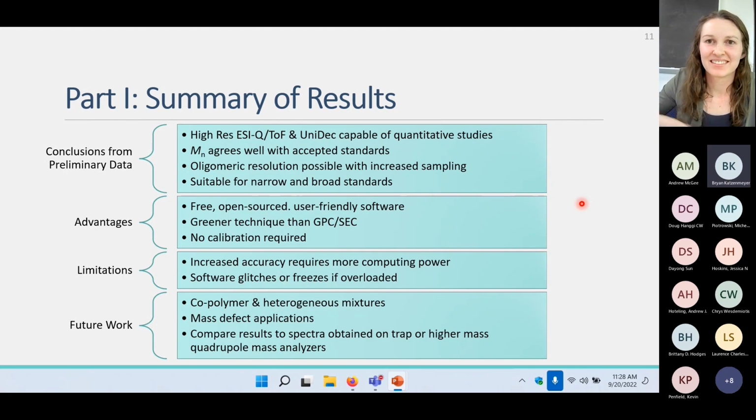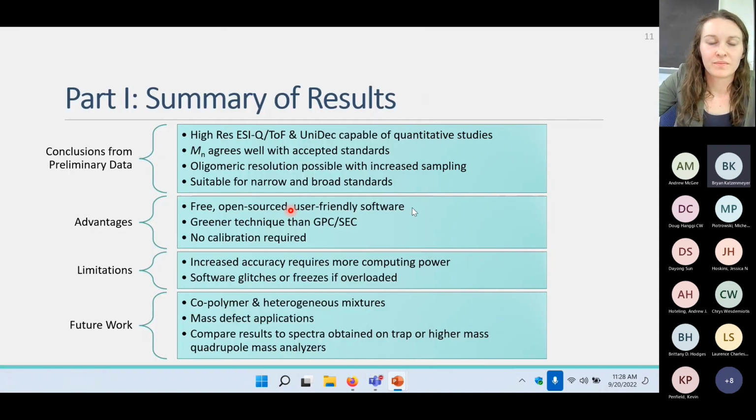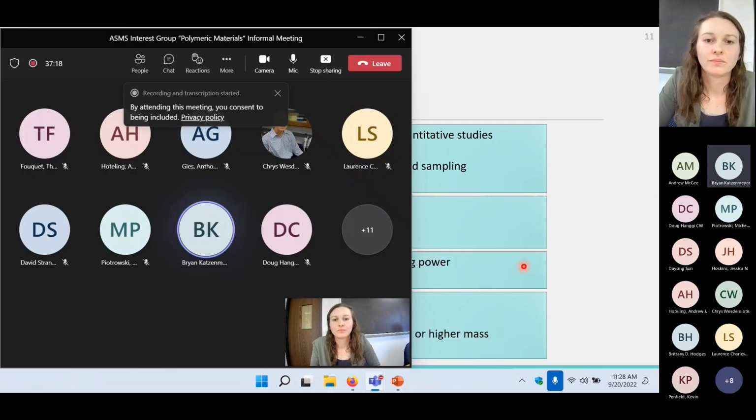No problem. We have the MRT, which is multi-reflectron time of flight, that allows us to go up to 200,000 resolving power, in excess of that for MALDI and electrospray data. But from a mass range standpoint, that does limit us to about 9,600 to do that many passes in the time of flight region where this analyzer is. There is an option to run in what we call a diamond mode, which does decrease the mass resolving power, but it extends the mass range up to about 20K.